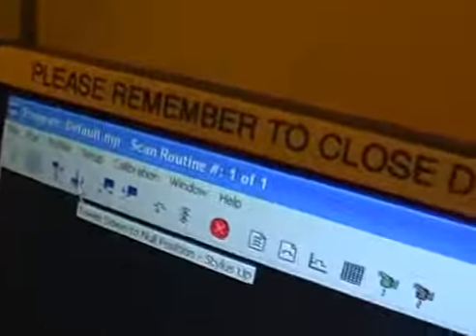And then we start to put the tip down to your sample by pressing the tower down button. And then you will see the tip start going down to the sample. You can slightly move the sample to make sure that the tip stops on your sample surface. And once the tip is on your sample, you can see it from the computer screen.